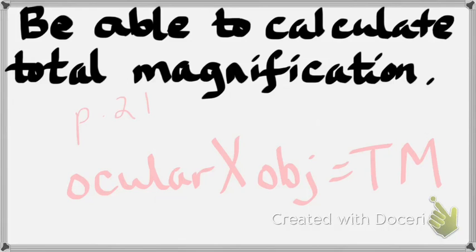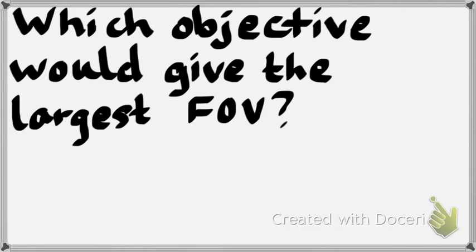And then Kelly said the 40 is clicked into position. So on the test, what will you pick? For a total magnification. 40? 400. 40's going to be a choice. 10's going to be a choice. 50 is going to be a choice. Yeah, you got to know to take the two numbers and do what with them? Multiply them. So then the TM would be 400? Uh-huh. What's TM stand for? Total magnification. Thank you very much.